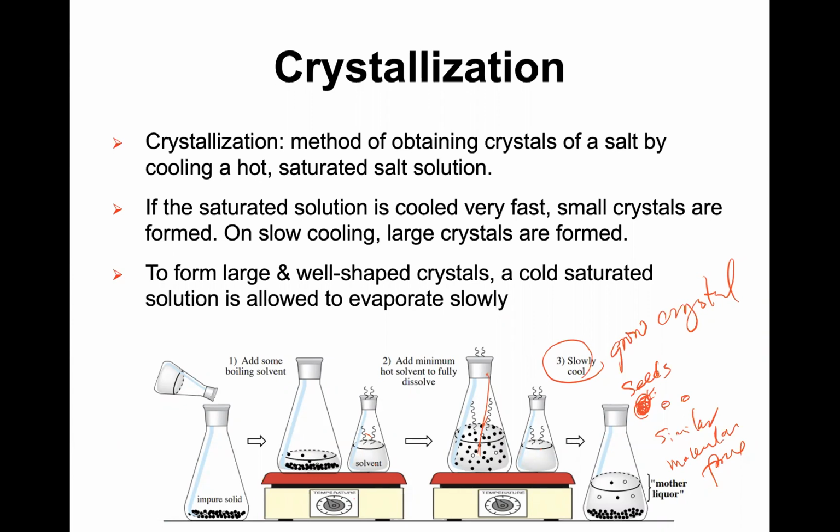temperature. But the question is, if you cool down quickly, then in this case, all those particles dissolved in the solution, their solubility decreases, they can squeeze out from the solution. So in this case, they will not form the regular shape to form the crystals. They will form amorphous solid. In this case, they will form so many superfine powders. Since the process of the precipitation is very fast, some of the impurity in the solvent will be wrapped inside of those particles. So you will not get pure crystals or pure solid.